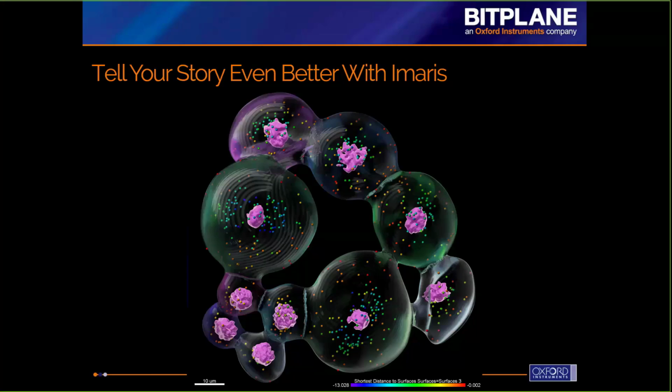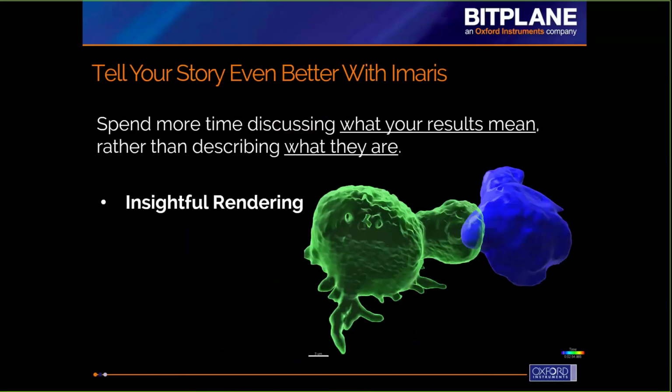So not only is this new rendering, which we're calling insightful rendering, there to be eye-catching, but again, it's there to help you really reveal your results to your audience in an easier way. And a lot of that is based around the improved transparency options that we're offering.